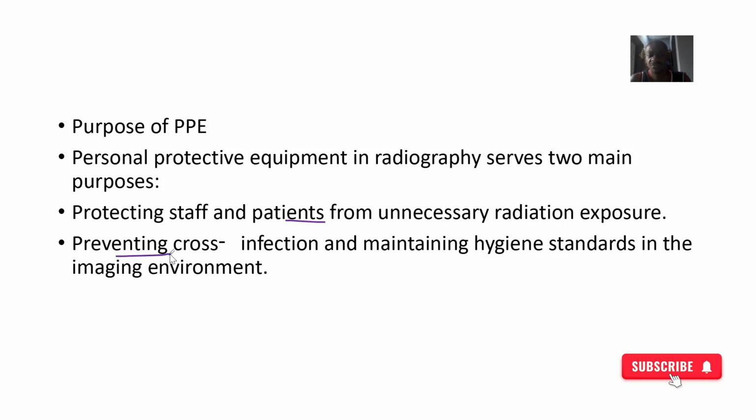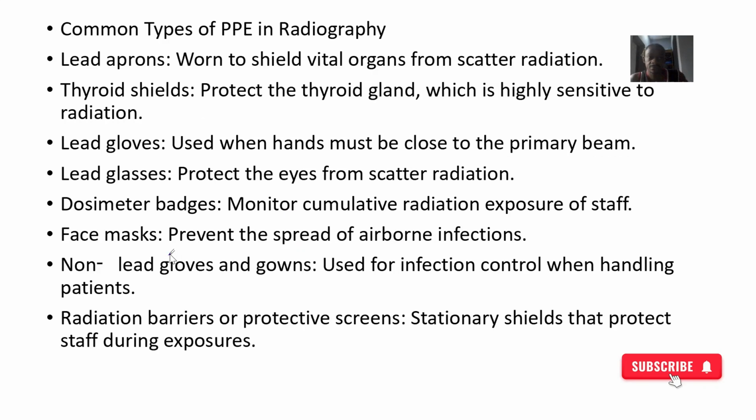It also prevents cross-infection, infection moving from the staff to the patient, or infection moving from the surfaces to the patient, or vice versa to the staff too. Do you understand? That's just what we got.